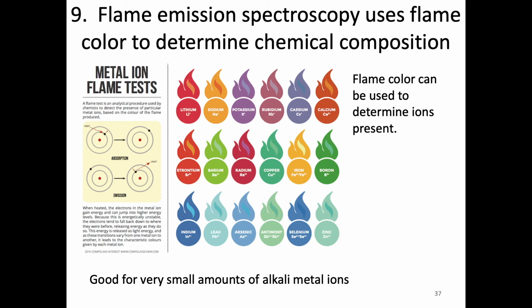This is basically a fancy version of what you might be familiar with as the flame test. You put a small amount of some material in a flame, and based on the ions present, it will change the color of the flame. So lithium is this reddish color, sodium is orange, potassium purple, copper is this green color, indium is this bluish color, lead is this lighter color. This is also the same principle behind firework colors. But basically, this would allow us to do this in a more controlled manner.